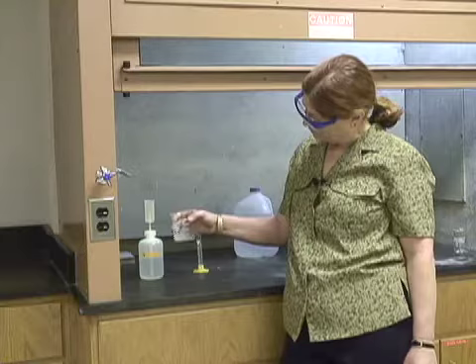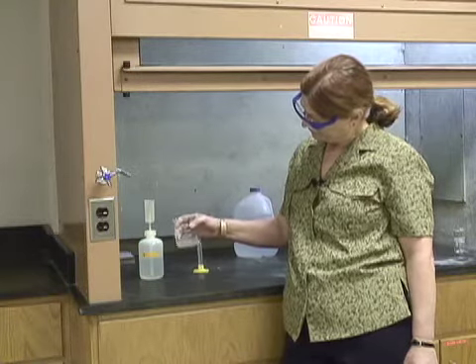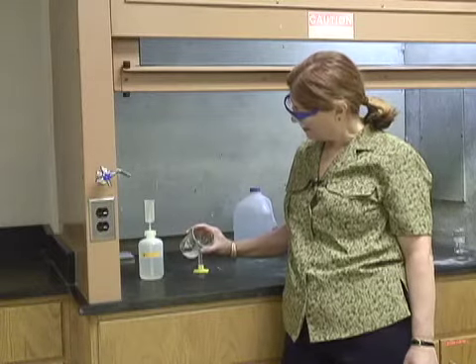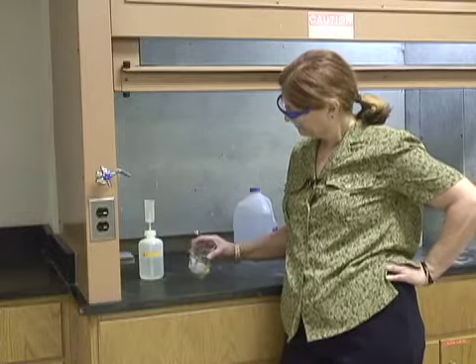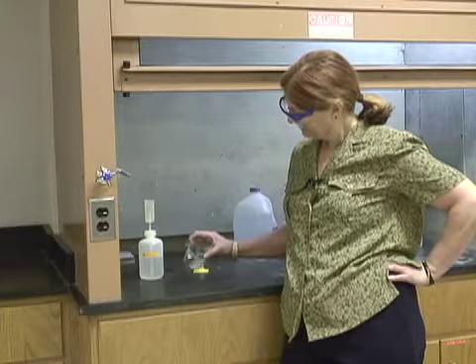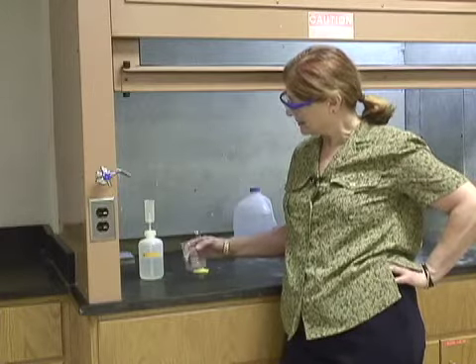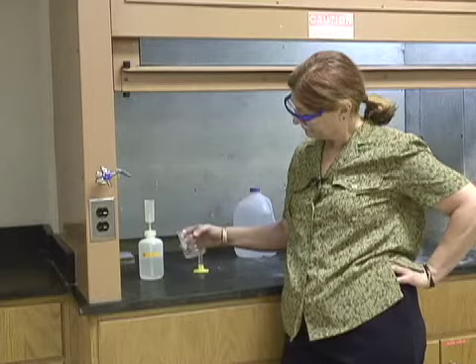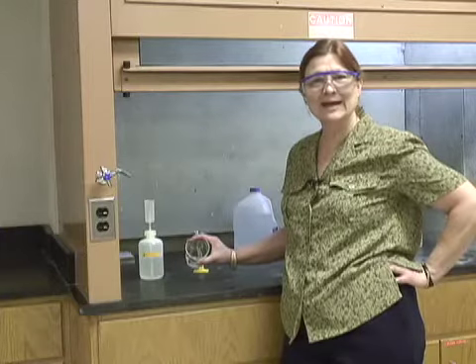I see there's getting fewer bubbles. It's the smaller pieces in there. Oh my, we're getting close. Tiny, tiny, but all of it must dissolve. All of that magnesium must dissolve in this solution. Almost. Look at that. There's hardly any in there.